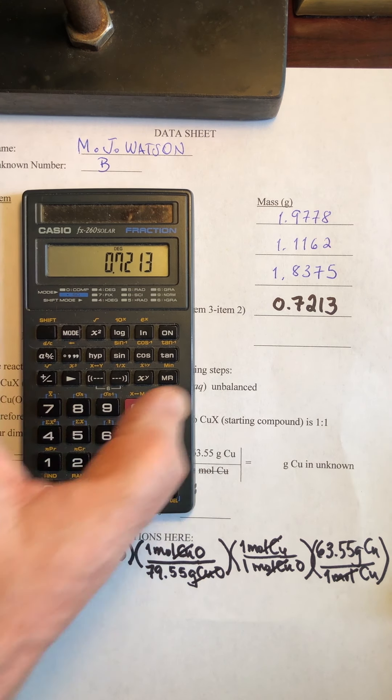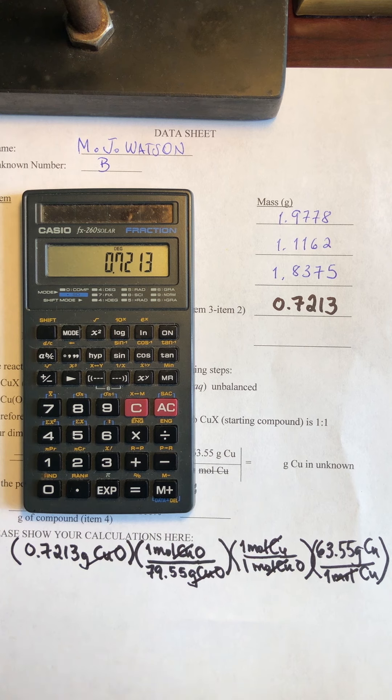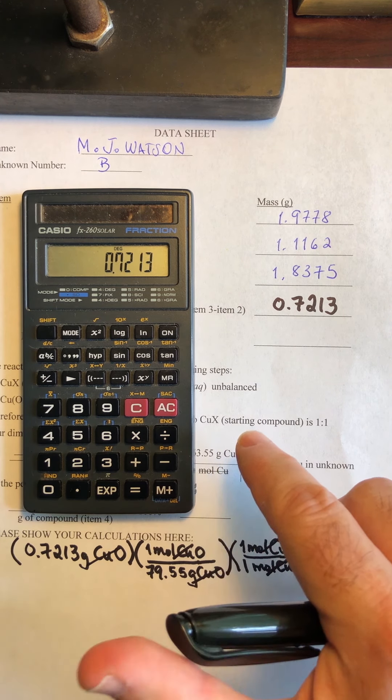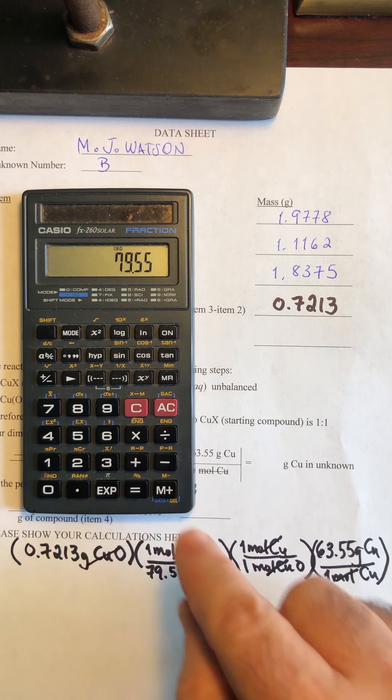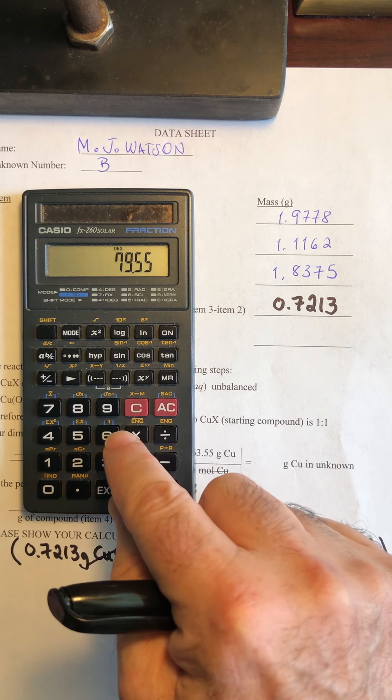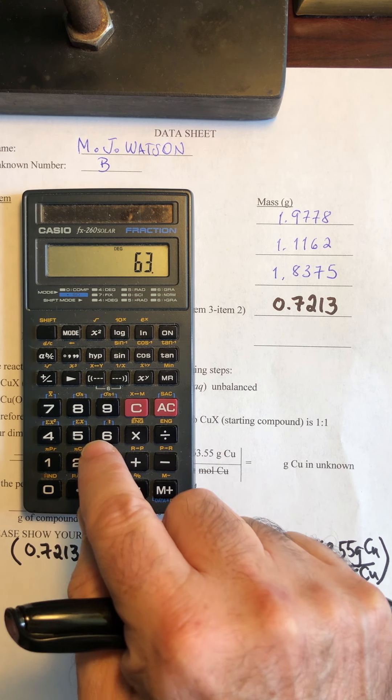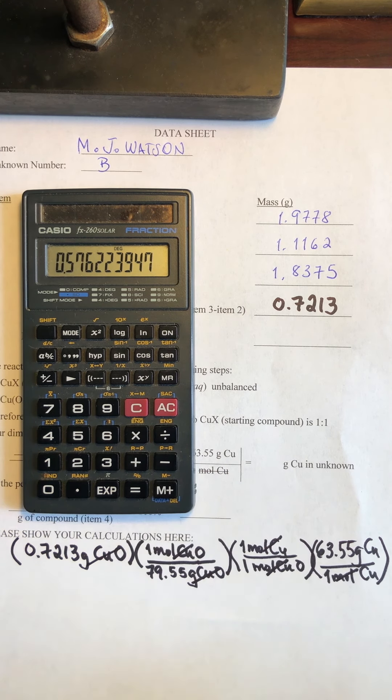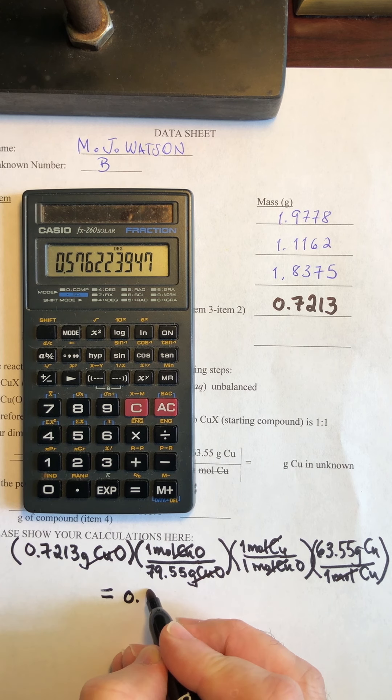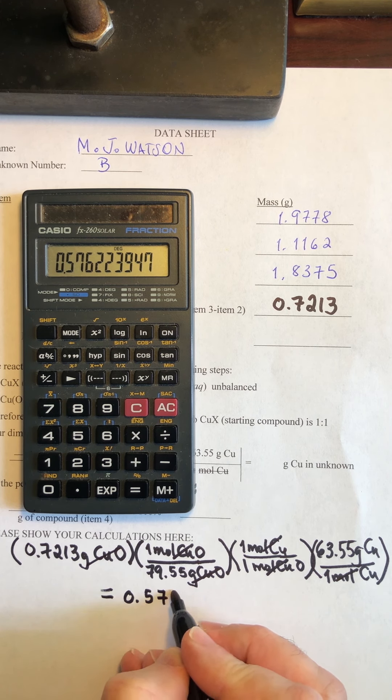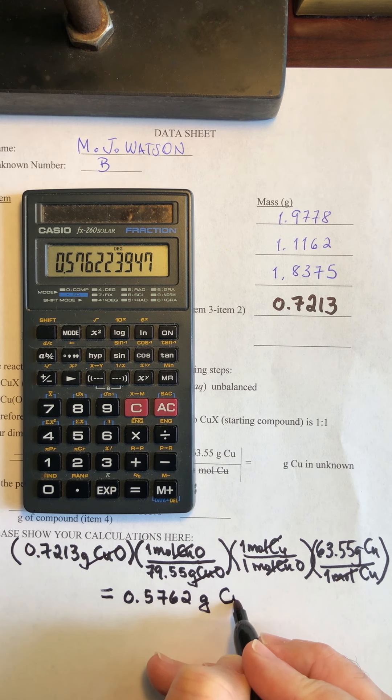So this is now going to give us the grams of copper in my original compound here. So let's see what that is. Let's do the calculations. We have here the mass. I left it in the calculator. We're going to divide by 79.55. This is one. And we're going to multiply times 63.55. And that gives us 0.5762.